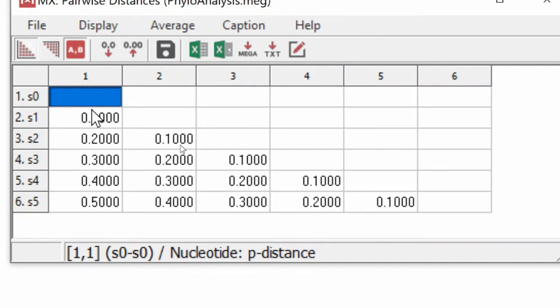And we see that the numbers are pretty okay, reliably reproducing our changes in the sequences. So 1, 2, 3, 4, and so on. And between, let's say, 3 and 4, we've got quite consistent numbers as well. So these numbers represent the number of substitutions, or genetic distance, between sequences.